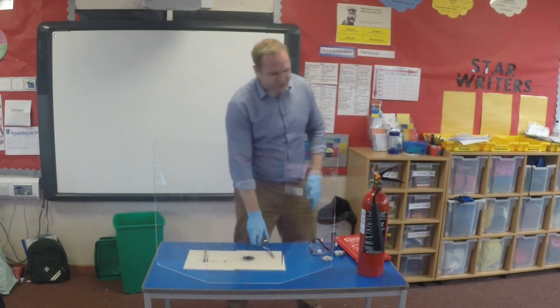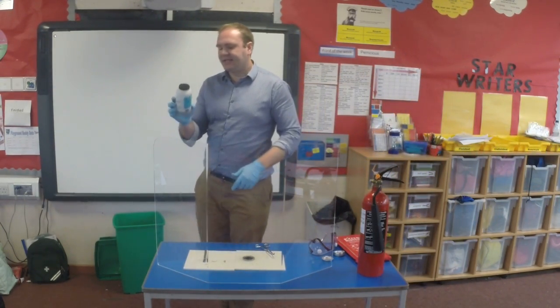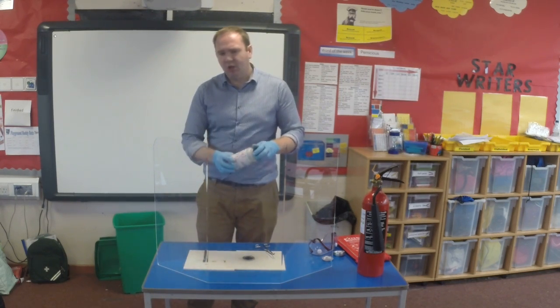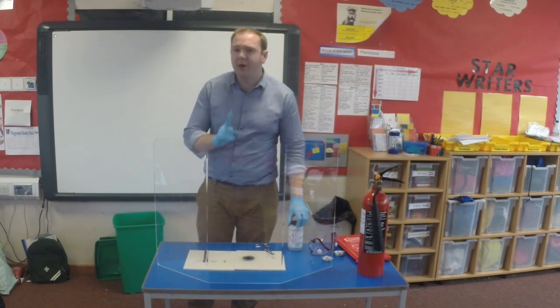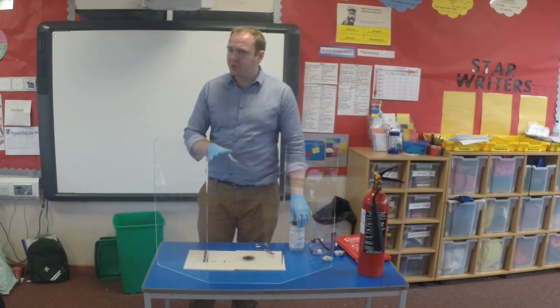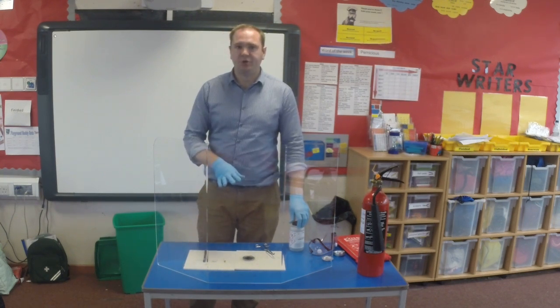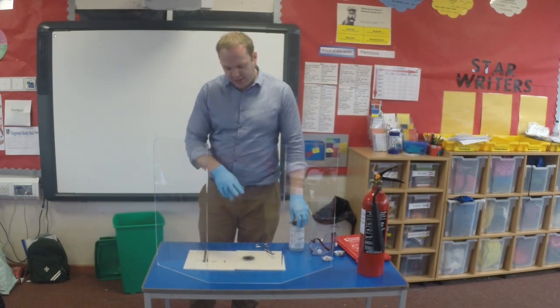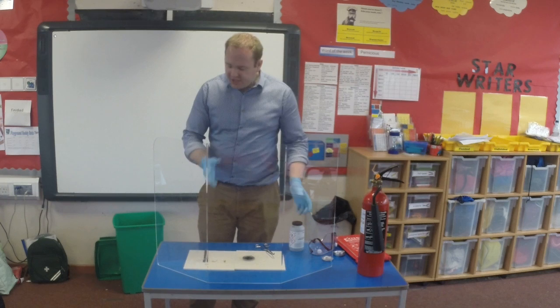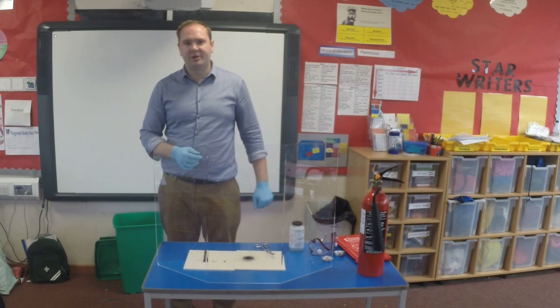Now, it is important to note that potassium permanganate is highly toxic to aquatic life in larger quantities. In smaller quantities, as a one-off experiment done very infrequently, in the sort of quantities that we're dealing with in school, it would be acceptable to dispose of it in that way. I'll link to a couple of pages that advise on how to dispose of this appropriately. But there you go. Visually appealing experiment, gets the kids very excited, and definitely worth doing at primary level. Cheers.